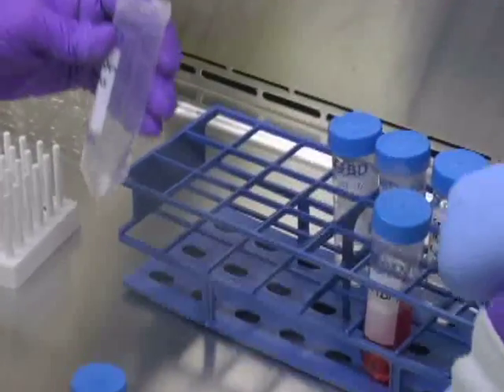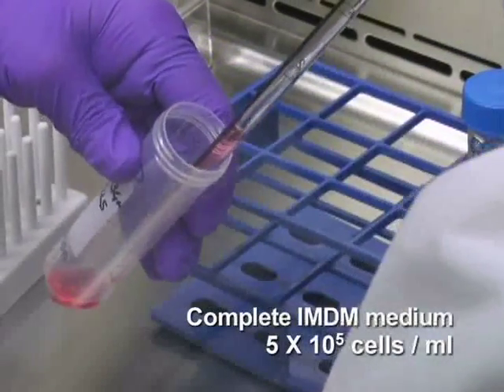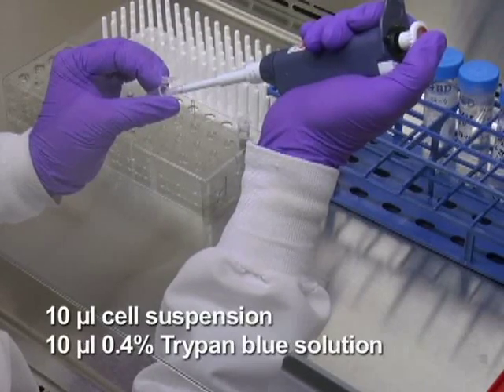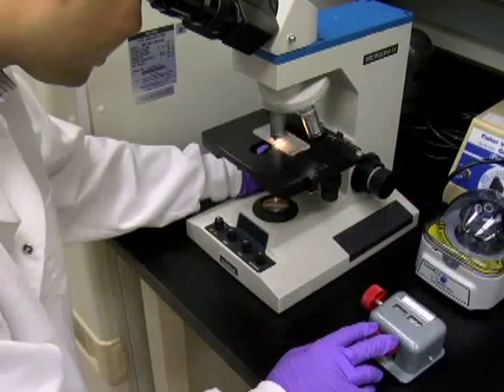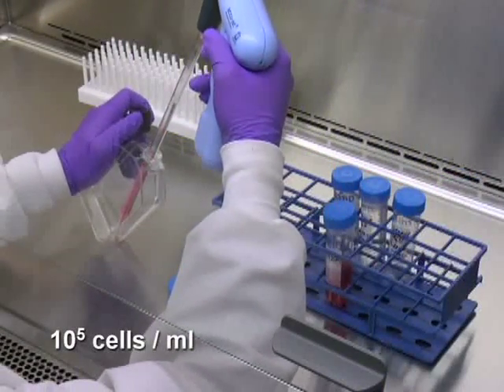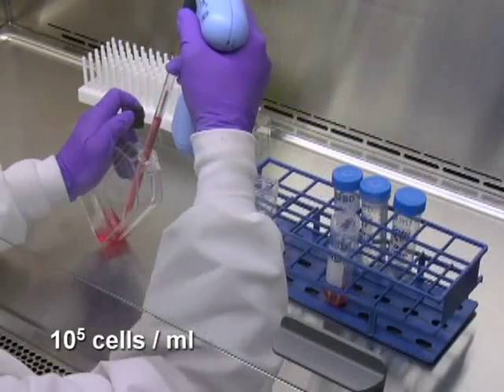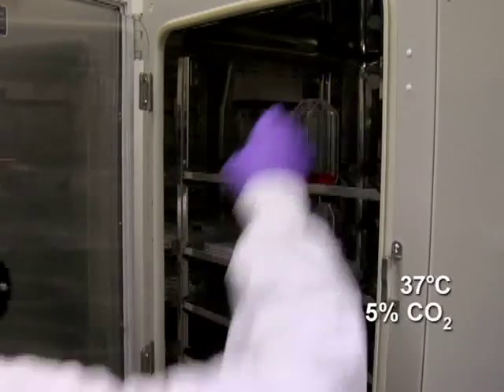Remove the supernatant and suspend the cells in complete IMDM medium at approximately half a million cells per milliliter. Finally, to determine cell concentration, take 10 microliters of the suspension into a microtube, mix with the same volume of 0.4% trypan blue solution, and count using a hemocytometer. Dilute the cells to 10 to the fifth cells per milliliter by adding complete IMDM medium supplemented with the mix of activating cytokines. Culture the cells in a humidified 37 degrees Celsius incubator with 5% carbon dioxide for 2 days.